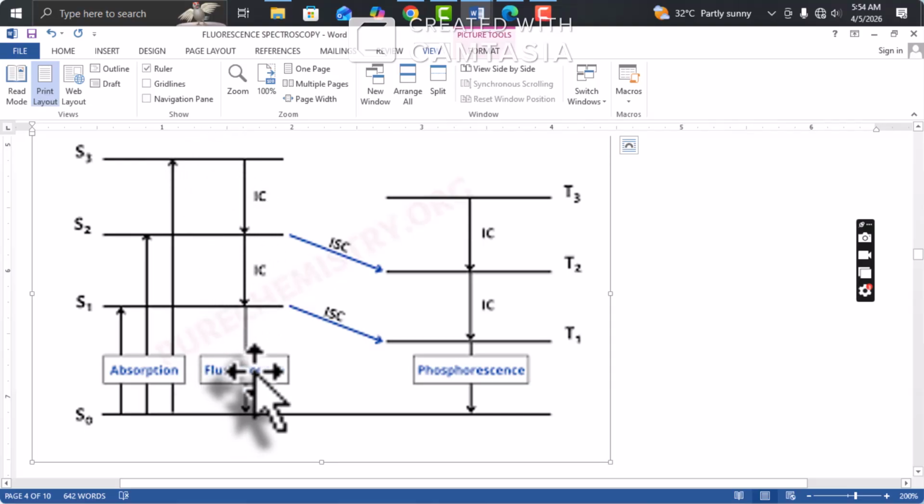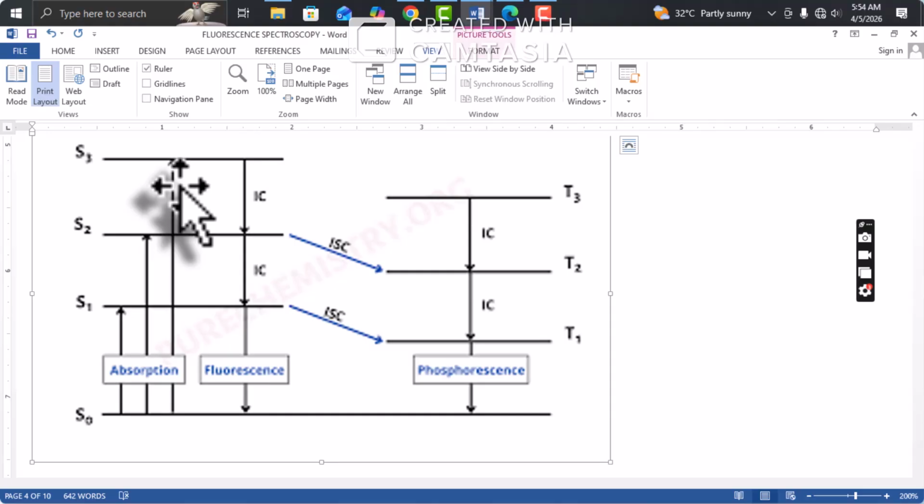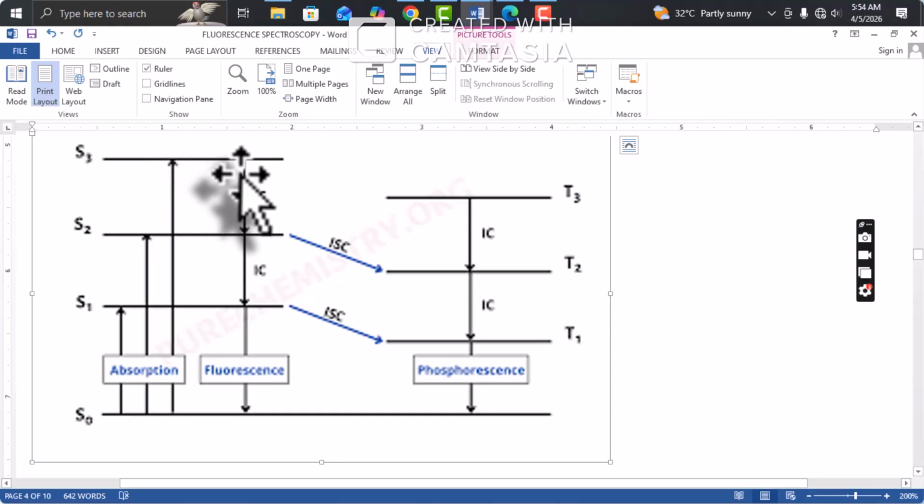And that's why when you have a fluorescent material and you introduce UV, it is nearly immediate that you see the fluorescence being given off. So it's very fast. The reason it's fast is the electrons are quickly excited and then de-excited, that means they fall back to the ground state.